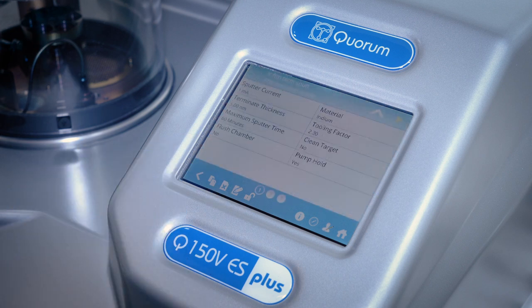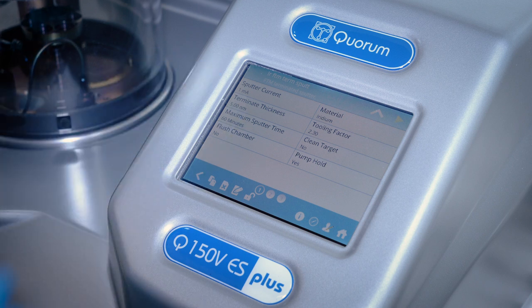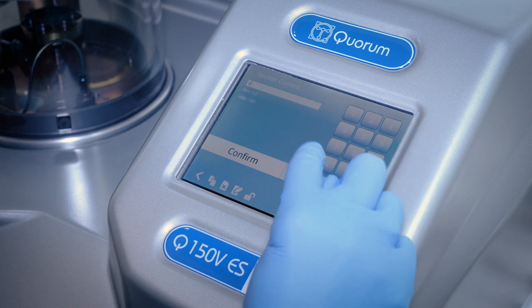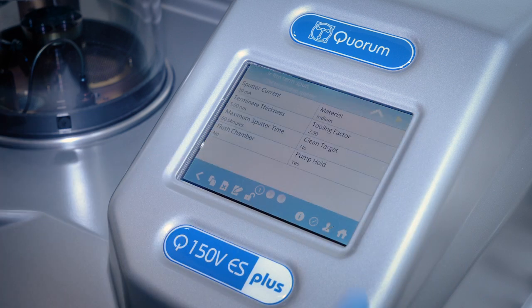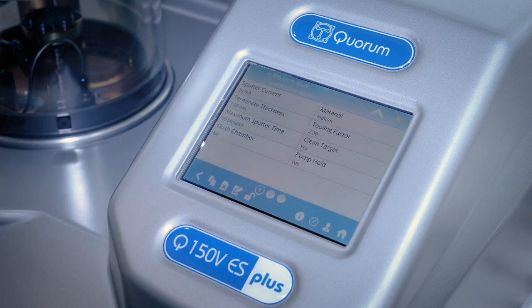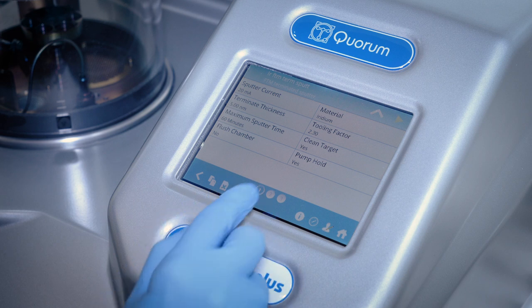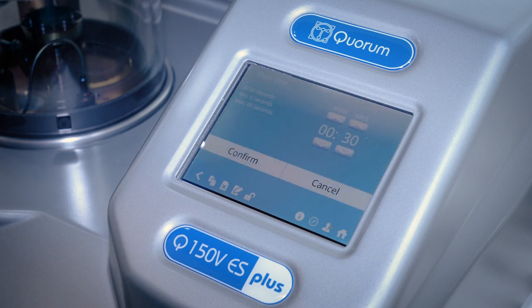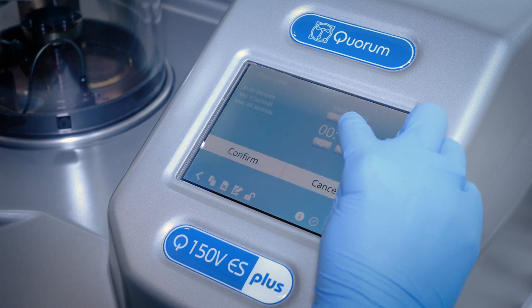Other parameters that can be changed include the thickness of the coating, the sputtering current as low as one milliamp, the pressure of sputtering gas or the operational vacuum. Cleaning the target is very important when sputtering oxidizing metals. It ensures that the user achieves the best coating quality. The new software allows a user to edit cleaning time and current to suit their sample.